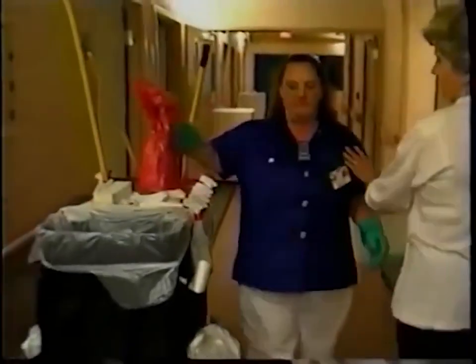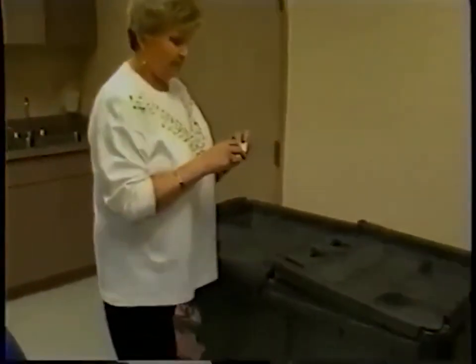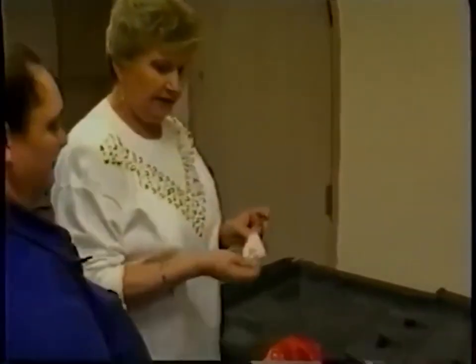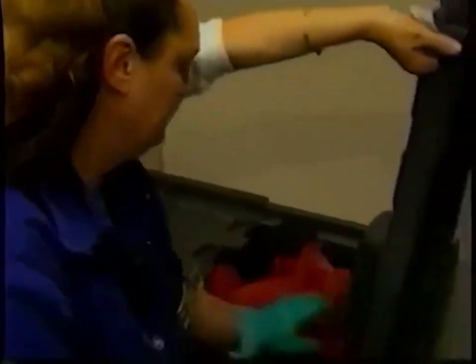In this example, the supervisor asked the environmental services employee not to put a red bag on a trash cart along with the regular solid waste. She is taking extra precaution because she is aware that if the two are mixed, and there is a leaking or ruptured red bag, the entire waste load is contaminated and must then be managed as biomedical waste.